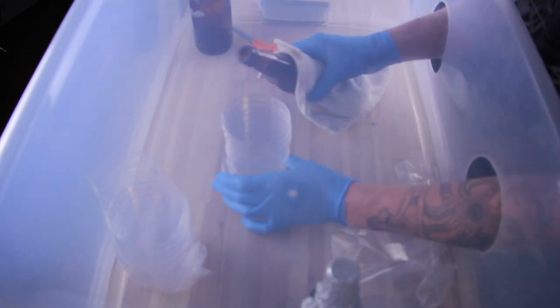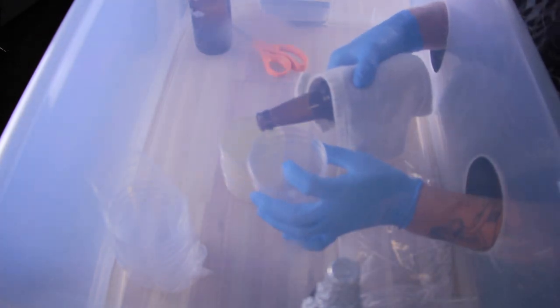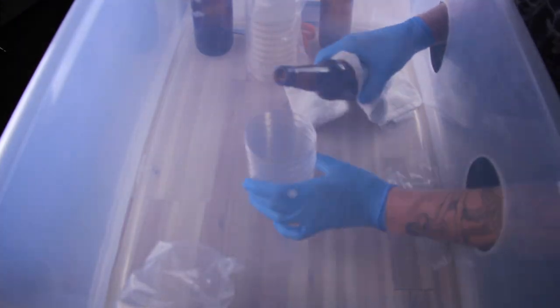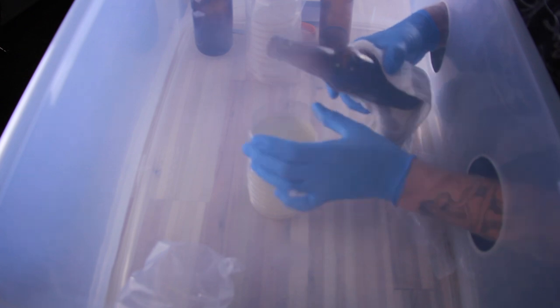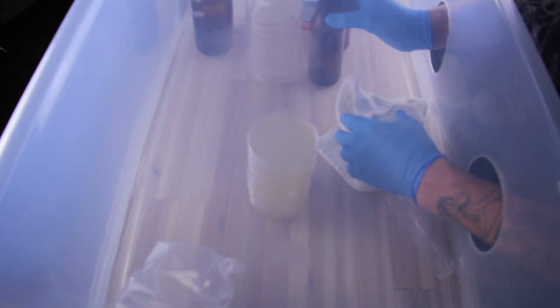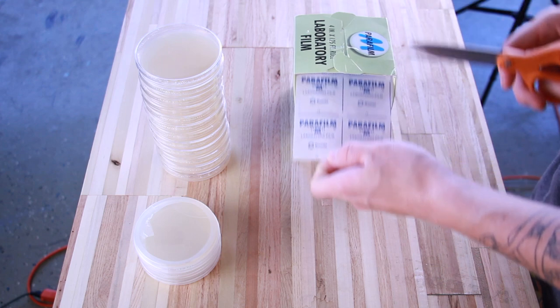I'm going to be pouring these in a stack, starting at the very bottom and then working my way to the top of the stack. I'm only pouring enough in just to cover the bottom, and if I have to later I'll go back and fill up some more if I have extras. But it turns out I had just about the perfect amount and I used almost all of it. I had a little bit left over at the end and I soon figured out why. You'll notice that I missed one of the dishes there, so I ended up with 19.